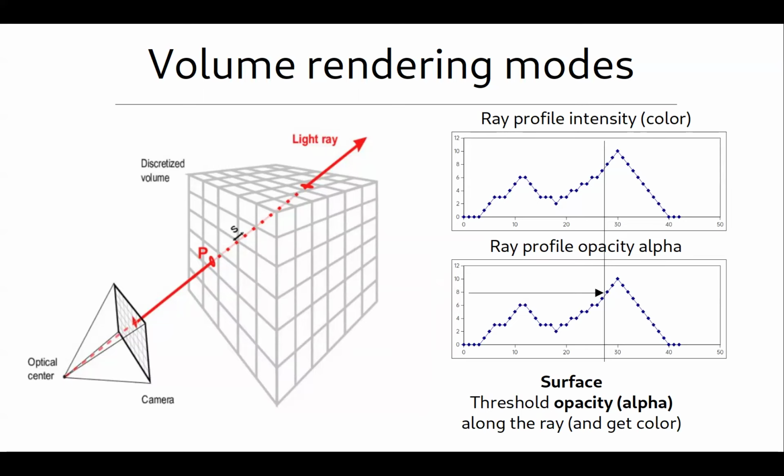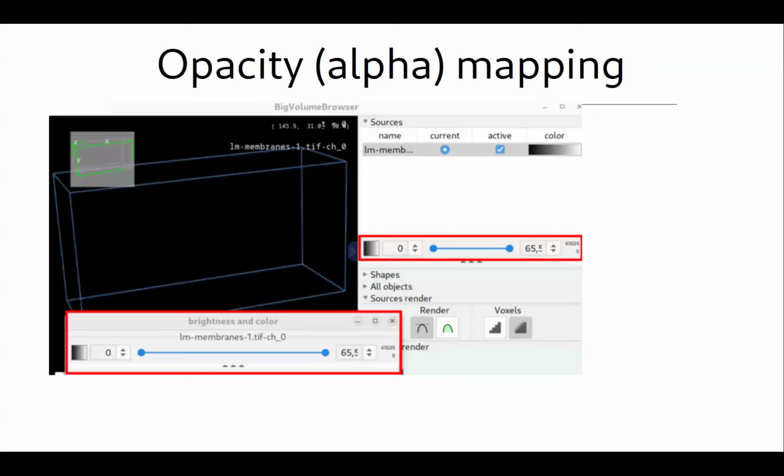So these are 3 different things. In principle, volumetric rendering includes both surface and maximum intensity, because it depends on both values, and the other two are extremes. So now we need to use the opacity.